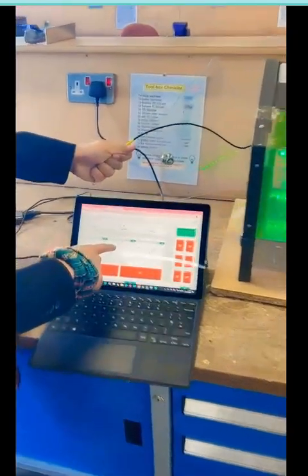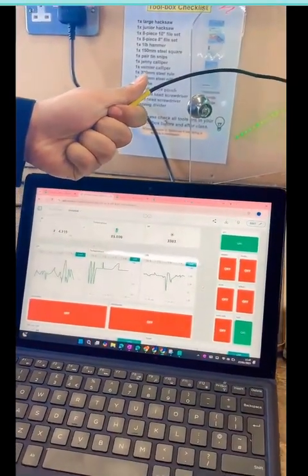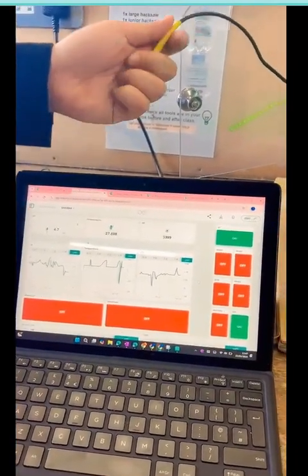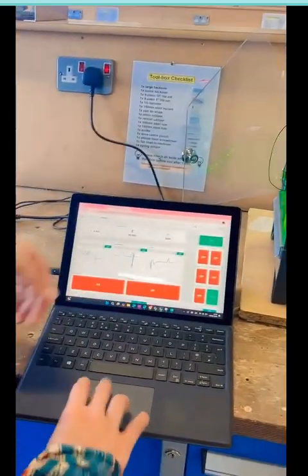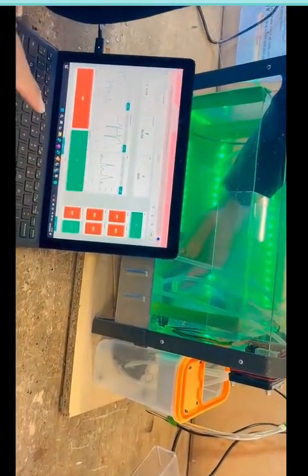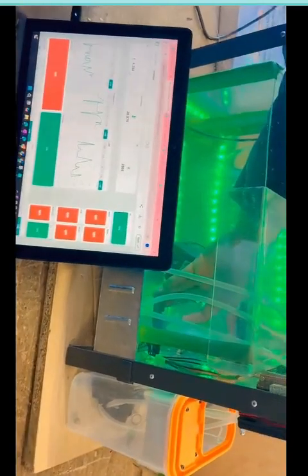This will go up, this will shoot up. That's because of my body temperature. See, going up. Huh? And if I pull this one up, it should turn green. And the next one should also turn green. Turn on.